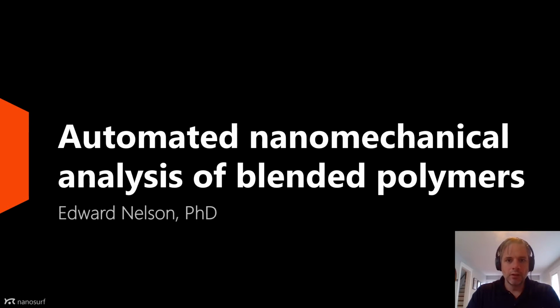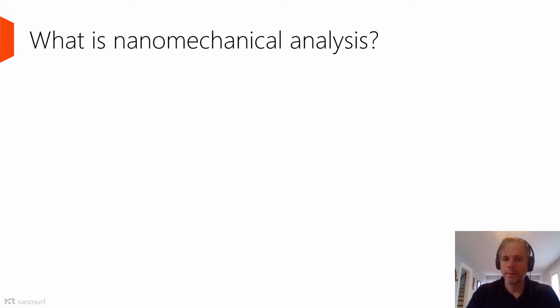In today's webinar, I will be describing a method to implement automated nanomechanical analysis of blended polymers. But first, maybe a little bit of background.